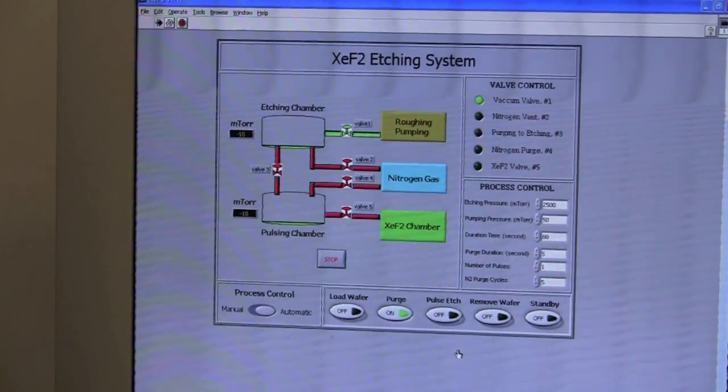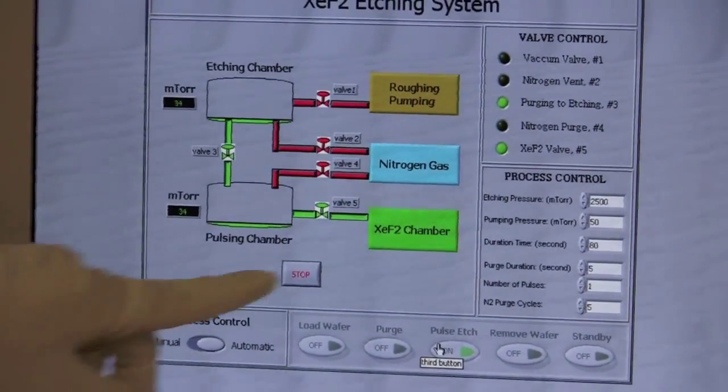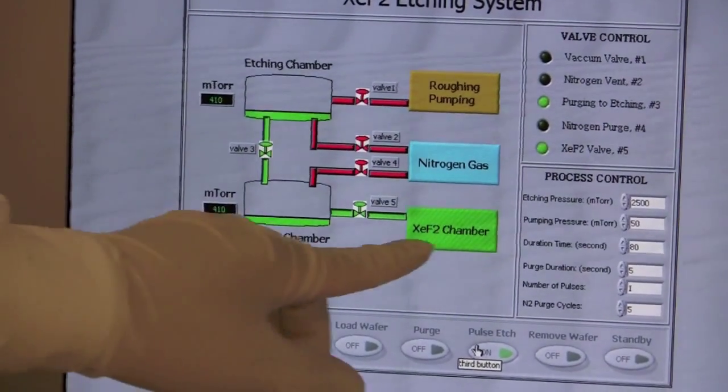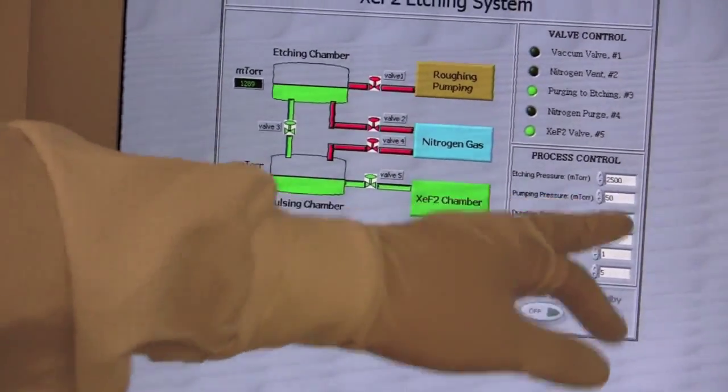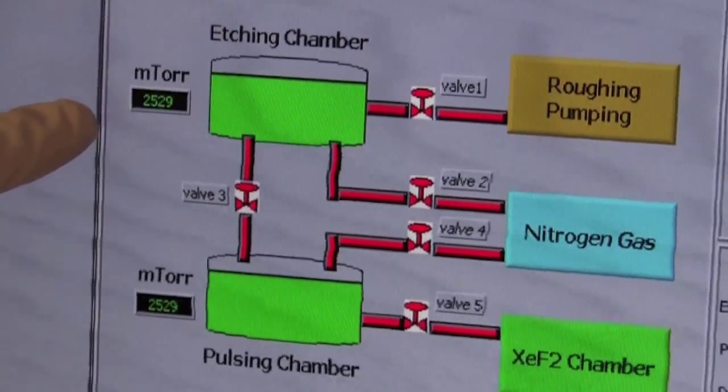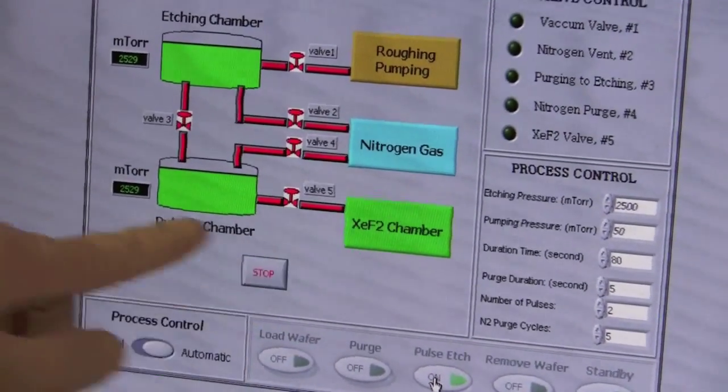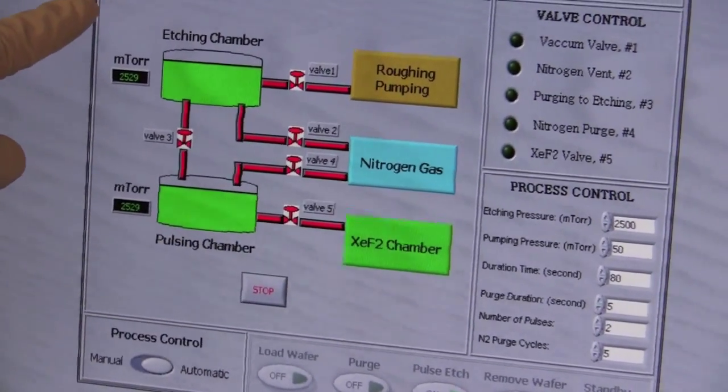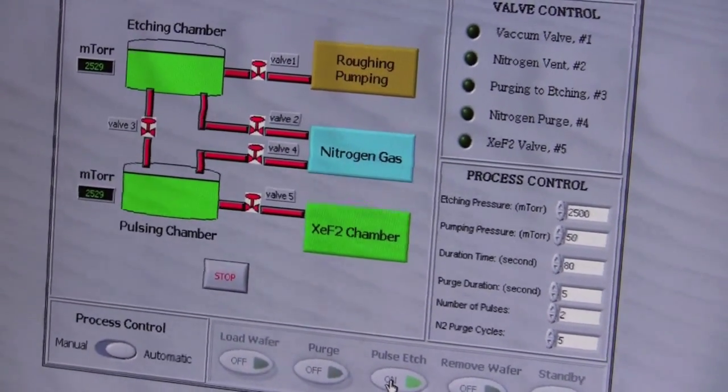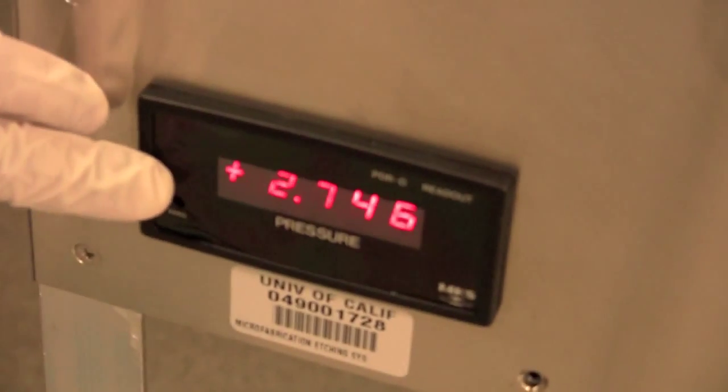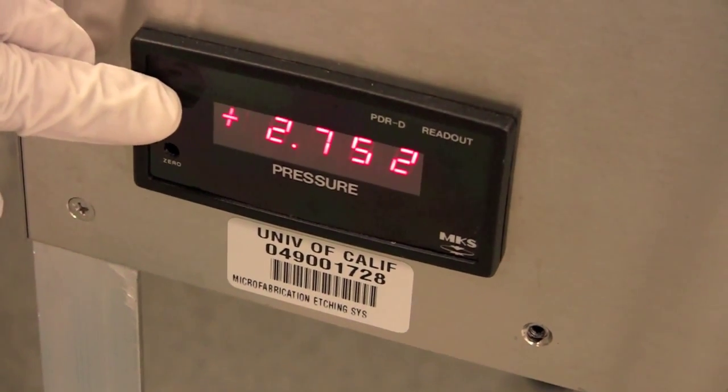Once you've opened the xenon difluoride bottle in the back, you're ready to press pulse etch. Now it will begin pulsing. As you can see here, the xenon difluoride chamber, or that bottle in the back, is now opened, and xenon difluoride crystals are sublimating into gas. The chamber is filling up, and it's going to hit our target pressure at 2,500 millitorr. Now the xenon difluoride chamber has reached 2,500 millitorr, the timer will start. As I mentioned before, this chamber doesn't have a true pulsing chamber. It just feeds directly through from the precursor bottle to the etching chamber. The precursor bottle is also used as an expansion chamber. This results in slightly higher pressures as xenon difluoride keeps being fed from the bottle, as you can see in the transducer down here. It's reporting about 2.7, and it's rising. It will continue to rise slowly as the etch process continues.